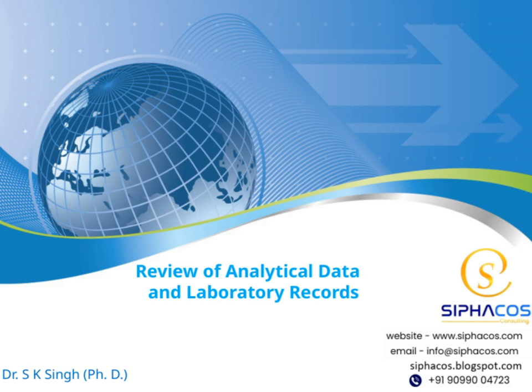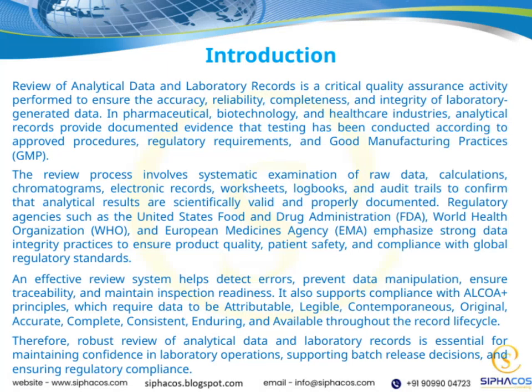Let's get started. Let's talk about the importance of reviewing analytical data and laboratory records. This activity is a cornerstone of quality assurance, ensuring that the data generated in our labs is accurate, reliable, complete, and maintains its integrity. In industries like pharmaceuticals, biotechnology, and healthcare, these records serve as documented proof that testing has been carried out according to approved procedures, regulatory standards, and good manufacturing practices, or GMP.